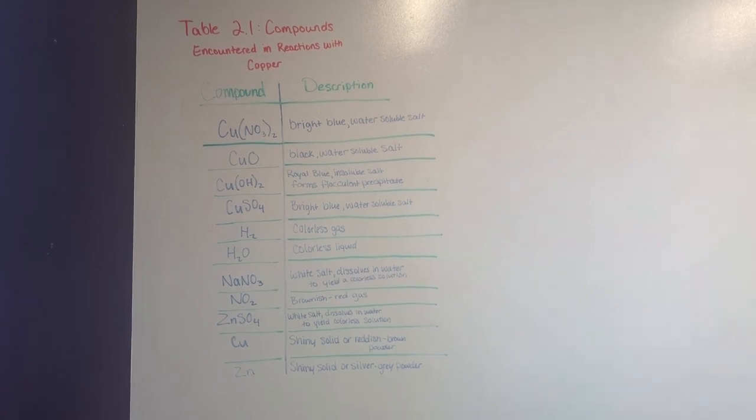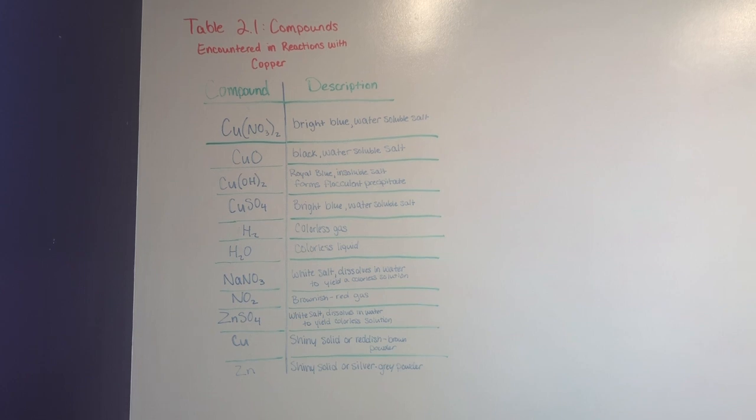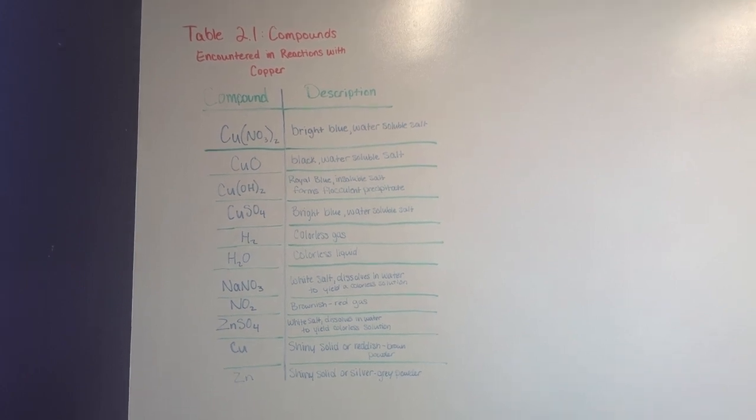This table will be a guide to use when identifying the compound to fit the description of the physical property.